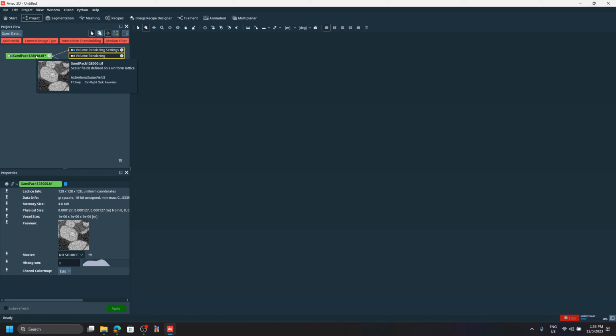Yeah. So the question, for the sake of the recording, is: is there a way to show just cubes instead of the smooth volume rendering? This is actually called voxelized rendering. Yeah, we can do it. Actually, I'm going to show it, because you can apply the voxelized rendering on the segmentation data.